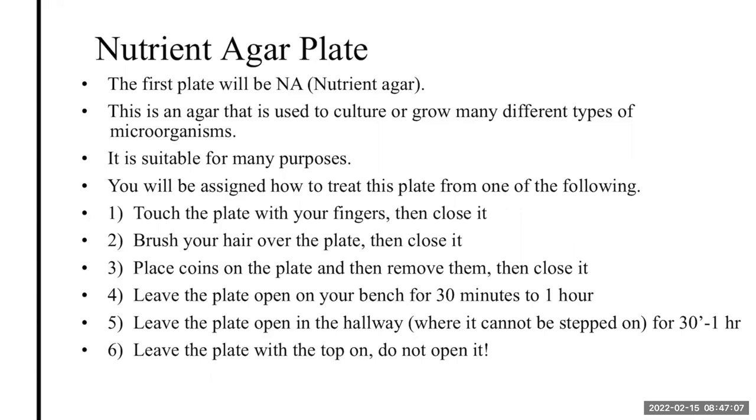So you can actually have the choice of whether you're going to treat the plate in a variety of different ways. You're going to touch the plate with your fingers, for example, and then close it, brush your hair over the plate, then close it, place coins on the plate, remove them, then close it, leave the plate open on your bench for 30 minutes to an hour, like for the duration of the lab, and then close it, leave the plate open in the hallway, somewhere where it can't be stepped on for 30 minutes to an hour, and then leave the plate with the top on and don't open it and see what happens.